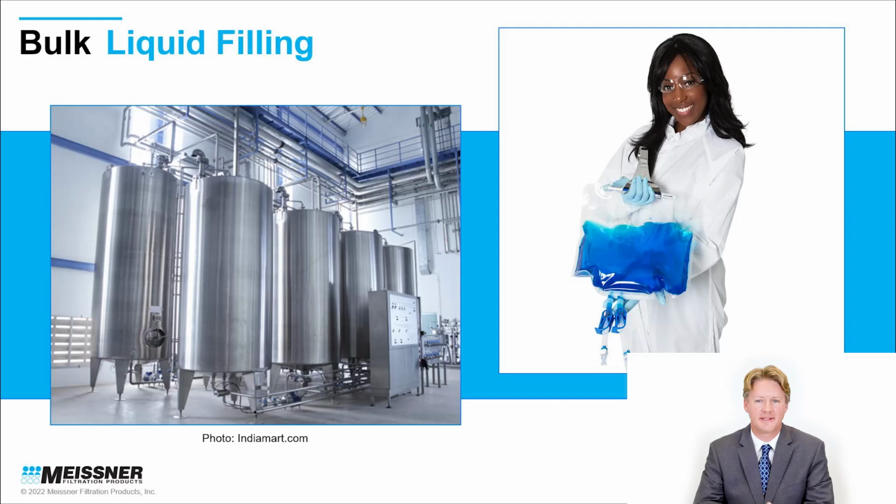To ensure that we're all on the same page, when we talk about bulk liquid filling, we're referring to batching large volumes of liquid solutions, such as cell culture media or buffer solutions, and then dispensing that large volume of liquid into many smaller containers, such as biocontainer bags.